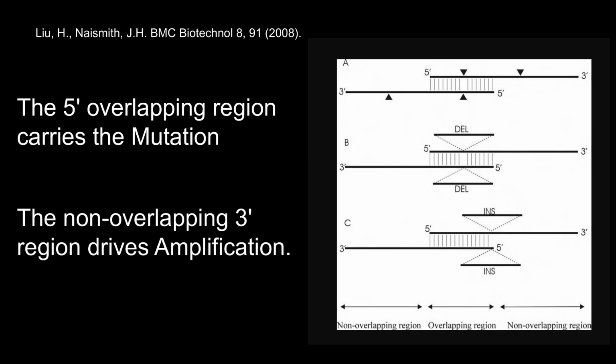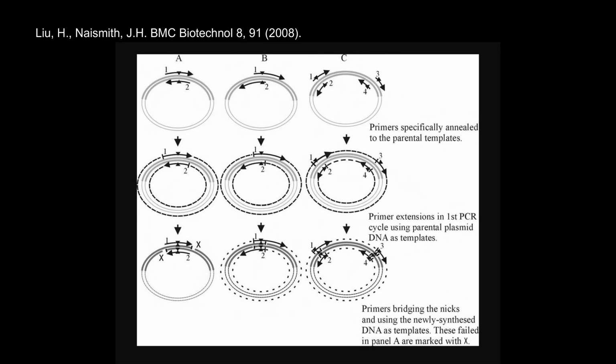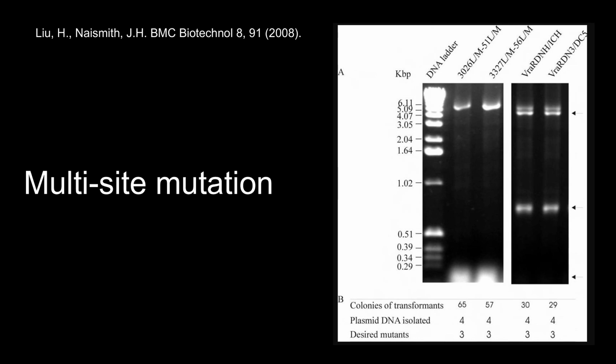The high TM 3' anchors ensure the polymerase is already moving before the 5' overlaps have a chance to interfere with each other. This design generates fragments that anneal during cycling to form nicked circular plasmids, effectively mirroring circular polymerase extension cloning. This mechanism is particularly advantageous for multi-site SDM, as multiple overlapping fragments assemble into a single plasmid in a one-step reaction.